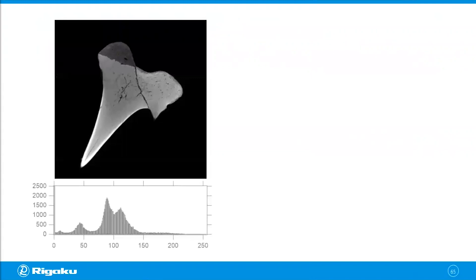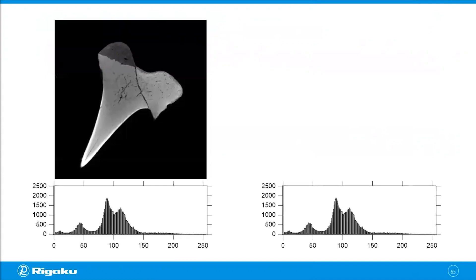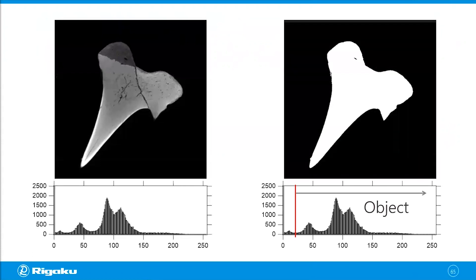Let's take a look at histogram-based thresholding in more detail. This is a cross-section of a shark tooth, and if you look at its histogram, you can set a threshold and say everything on the right side is the object and the rest is the background. You can then segment this image into the object and the background. A common way to set this threshold is to adjust the value and look at the image to see what number gives you the results you want. That works fine, but it is a little operator dependent.